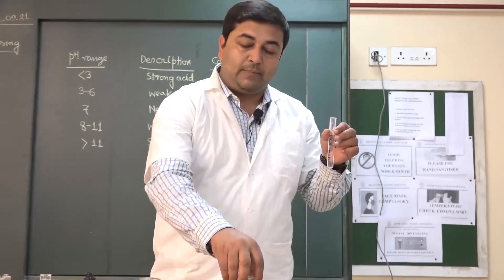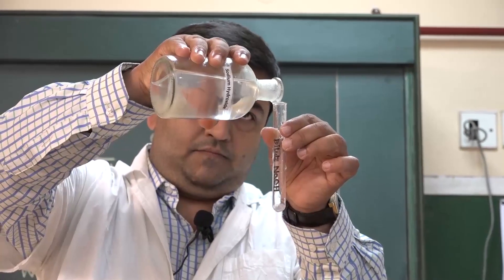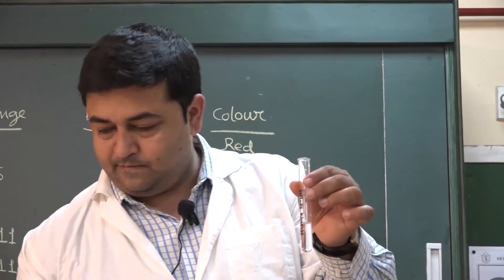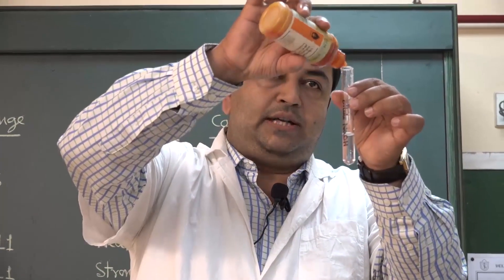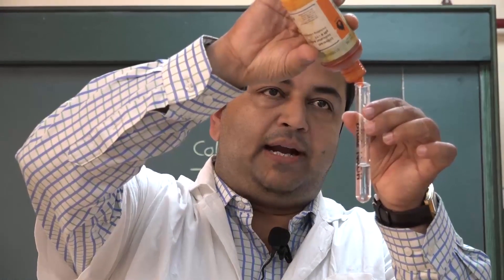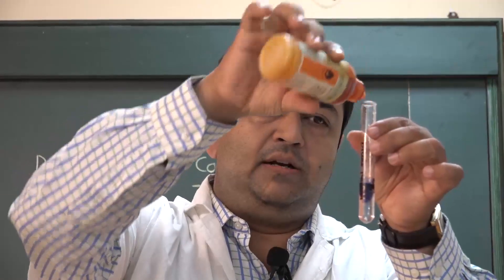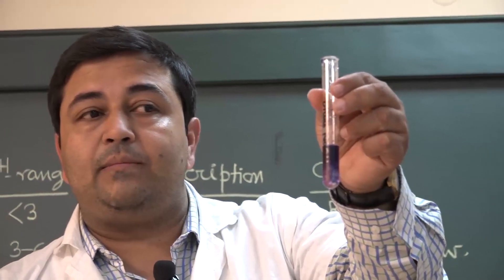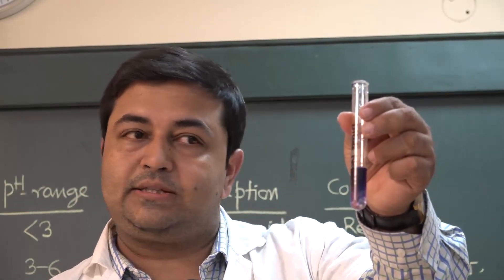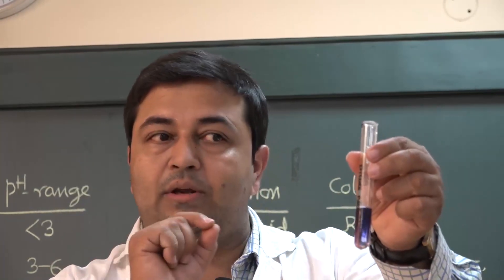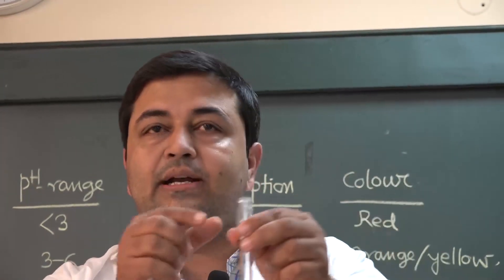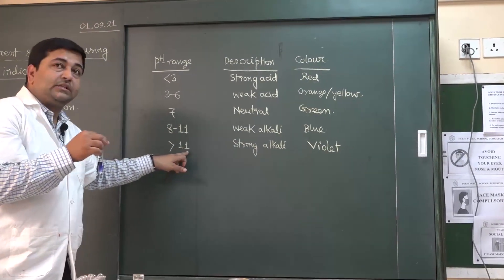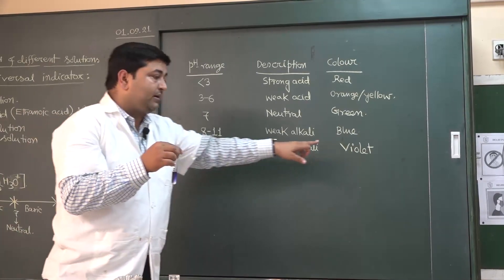Now I am taking sodium hydroxide into the test tube and checking its pH by adding one to two drops of universal indicator. The color becomes violet. When the solution becomes violet after adding the universal indicator, it means it is a strong alkali with pH more than 11.